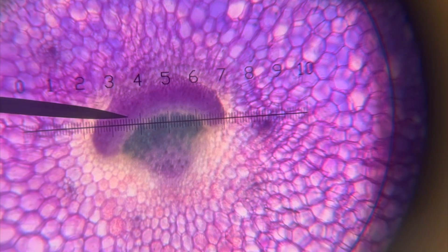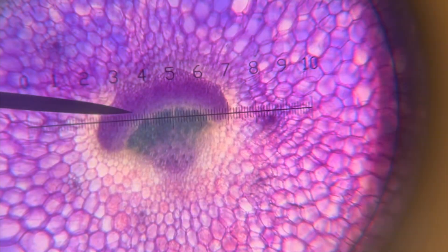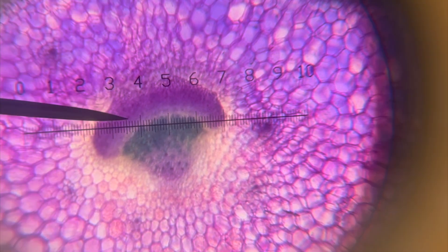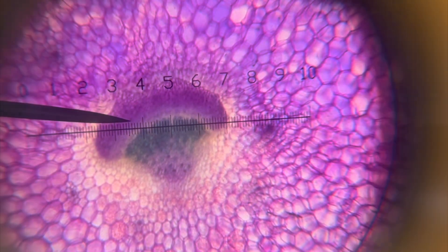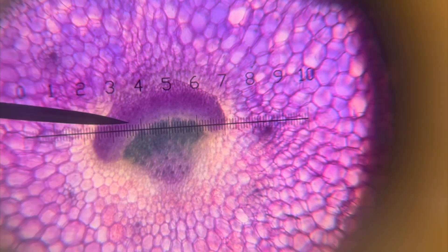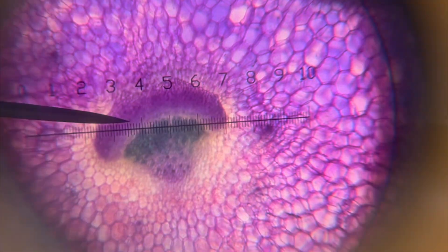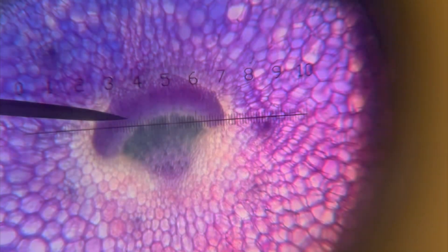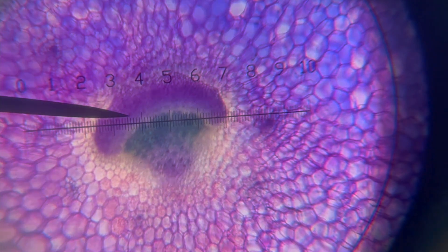You can also see the graticule, and before we do anything else we need to calibrate it, because we need to know what those divisions mean. Right now with the times four objective, the vascular bundle diameter spans roughly from about 2.5 to about 7 — so about 45 divisions — but I don't know what that means in actual distance, so we need a calibration to estimate the real size of that vascular bundle.